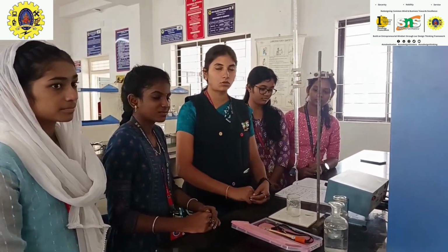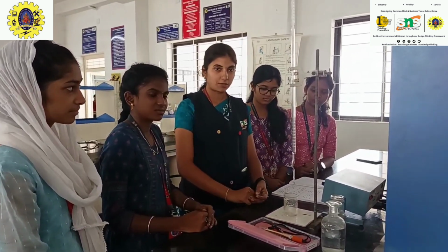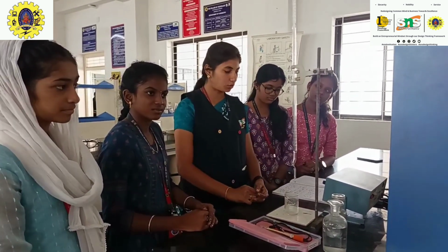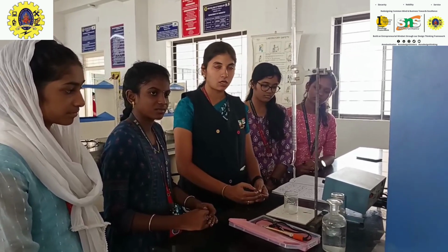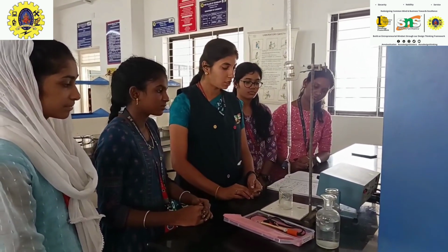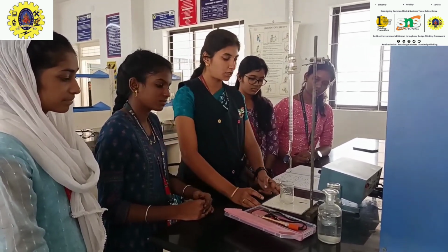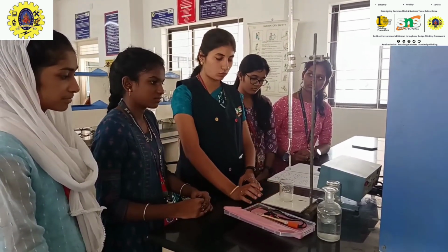Now I am going to talk about the conductometry experiment, a conductometric titration of a mixture of acids using HCl and acetic acid. The aim of this experiment is to determine the amount of strong acid and weak acid present in the given solution.